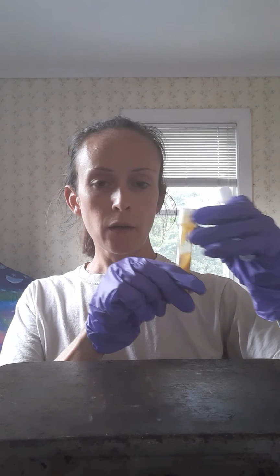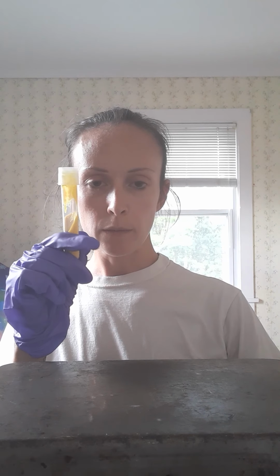So for this, we're going to be using our tube and our broth that we have and our culture of specimen. So this is going to be our culture.